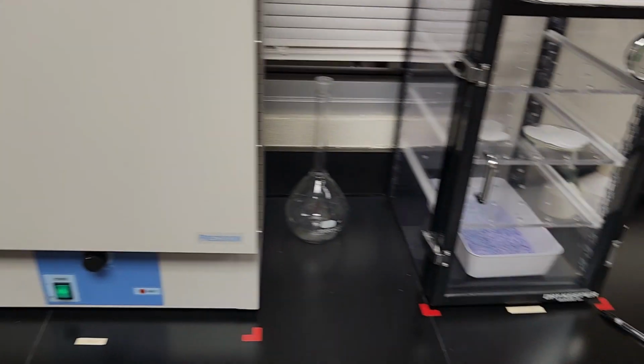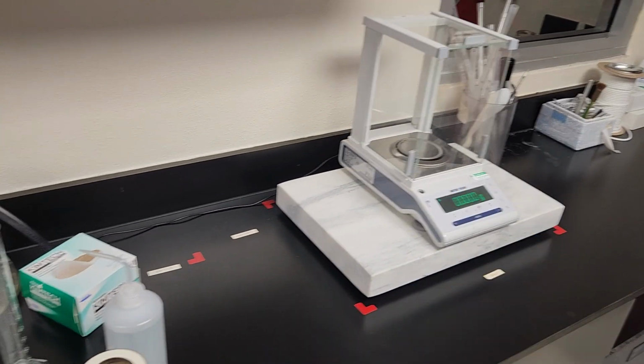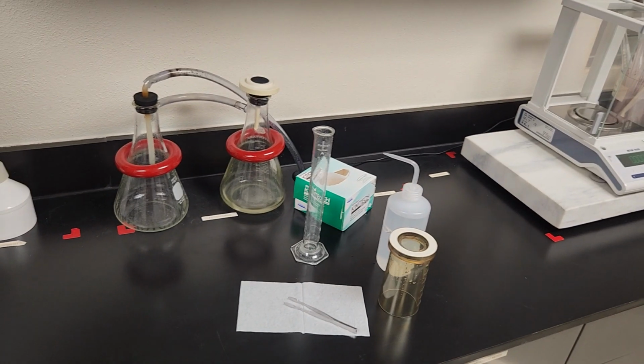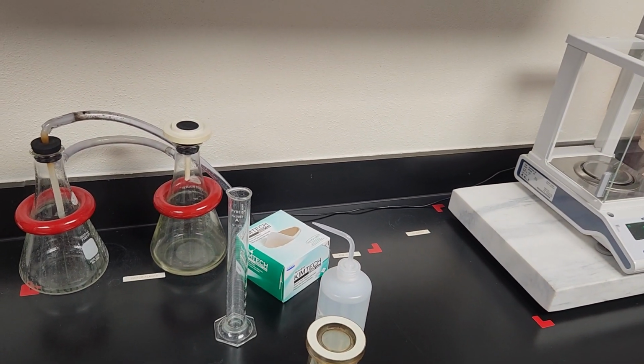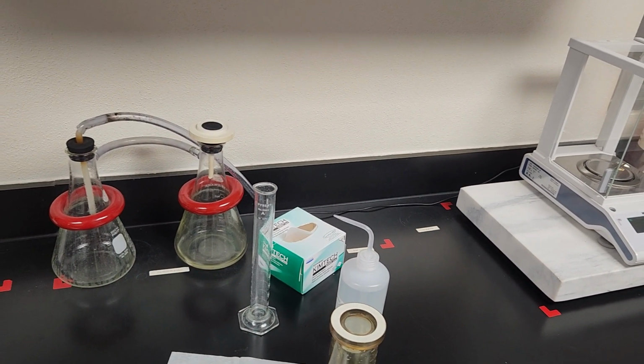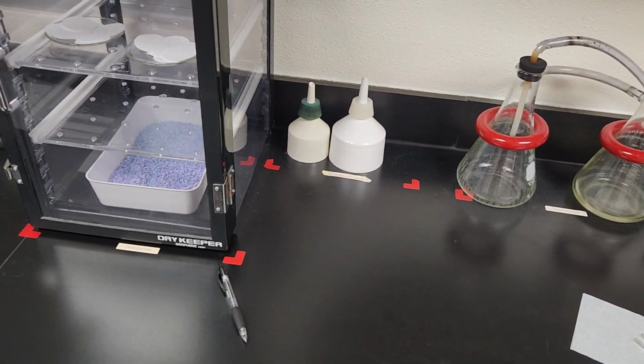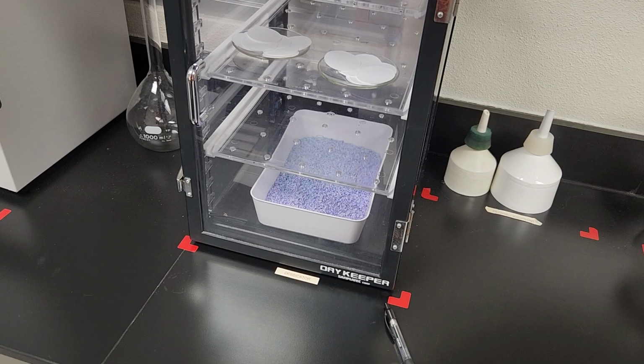Then later, we'll put it back in the desiccator. Then we'll measure it again, and then we'll take the final measurement minus the initial measurement. That is the filter with sample and the filter without a sample. We'll take the difference. So we'll come back and measure that later.